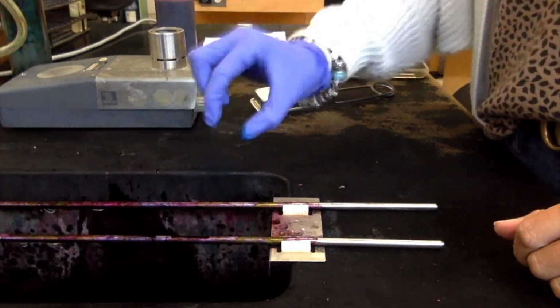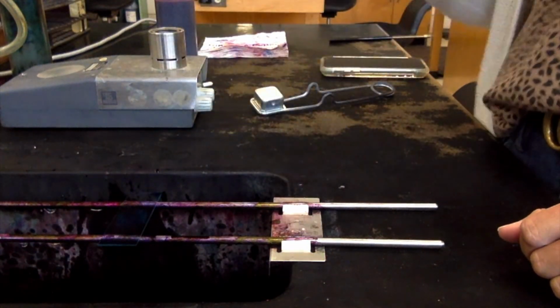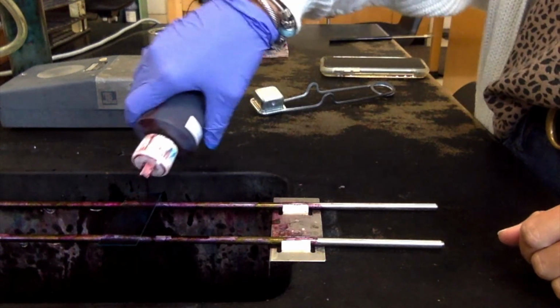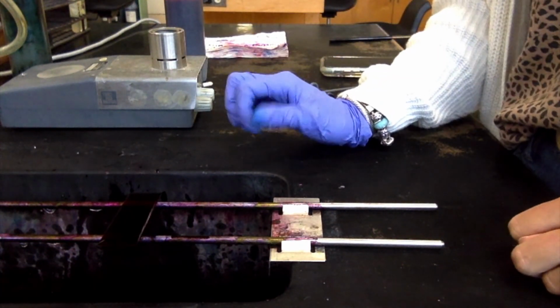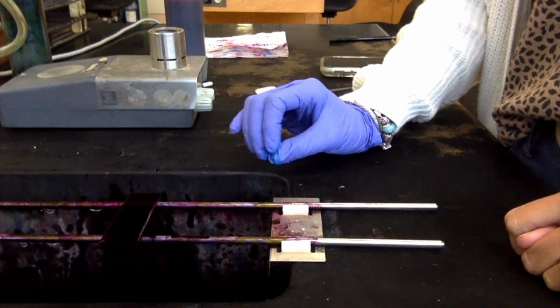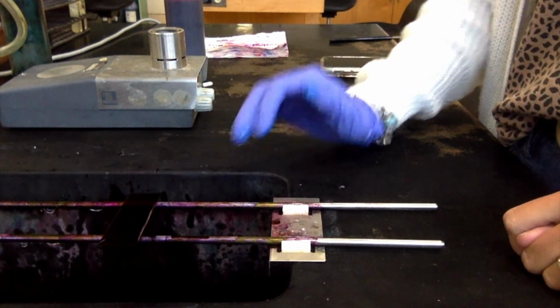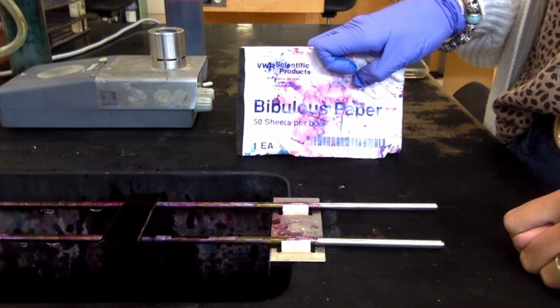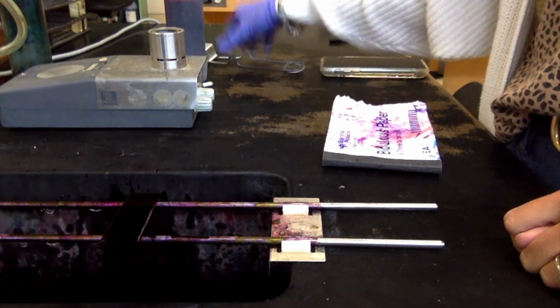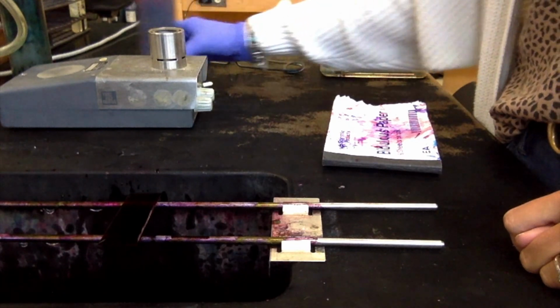All right, so now we're going to counterstain with our safranin. So we're going to pour safranin, and we're going to let this sit for 60 seconds. Now, after this sits for 60 seconds, then we're going to be ready to rinse again. So we're going to rinse it one last time. Then we'll blot it with our bibulous paper, just like we have the other stains, and then we will be ready to look at it on the microscope to see what we have.